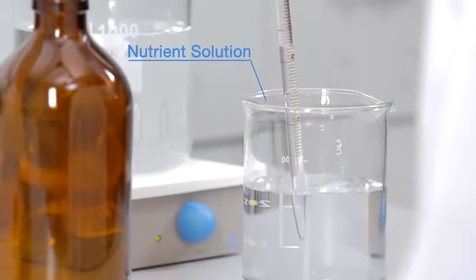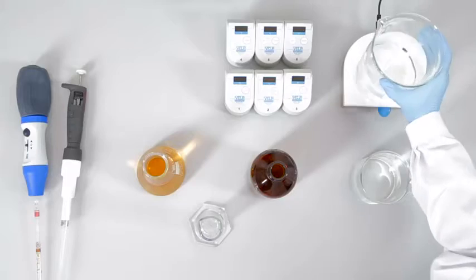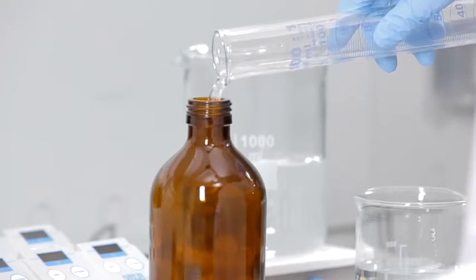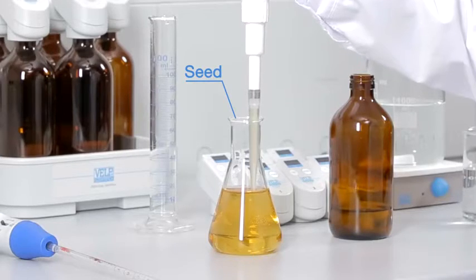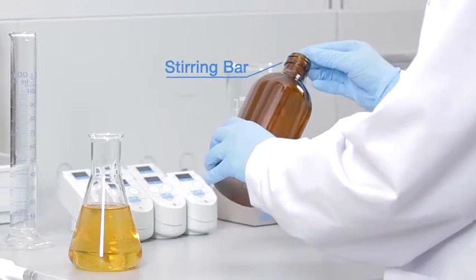The sample may require some pretreatment activities, such as homogenization, pH adjustment, dilution, nutrient addition and seeding, before being transferred to a dark glass bottle containing a magnetic stirring bar.